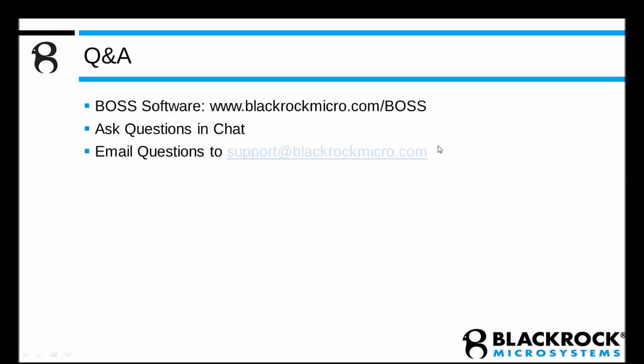There's also a question on whether it is necessary to repeat the demonstrated sorting process on each channel. Is there a way to sort all channels at once? That's another feature coming soon as well, along with the batch processing. Processing multiple channels at once, processing multiple files at once, or processing files sequentially are all something that's coming soon in version 1.2 in the next 3 months or so.